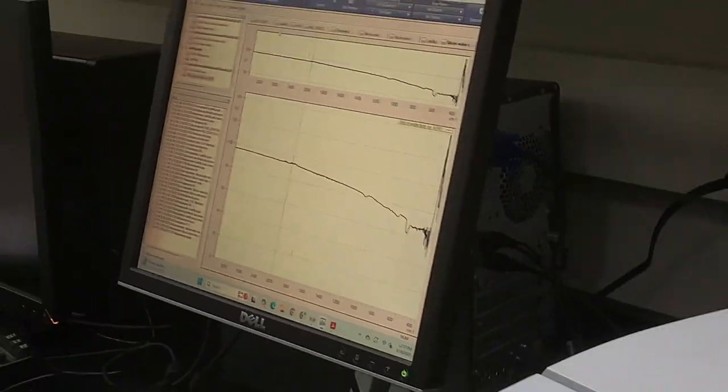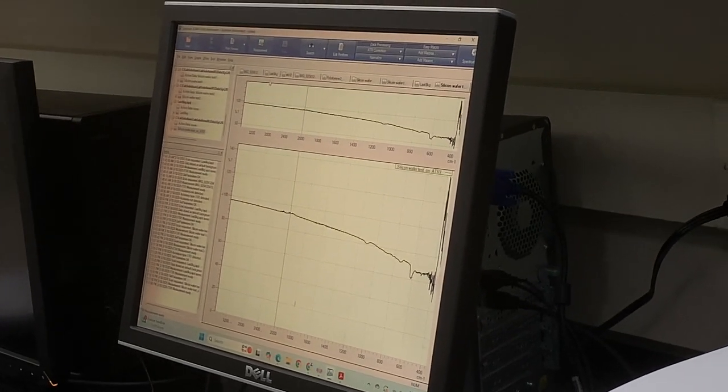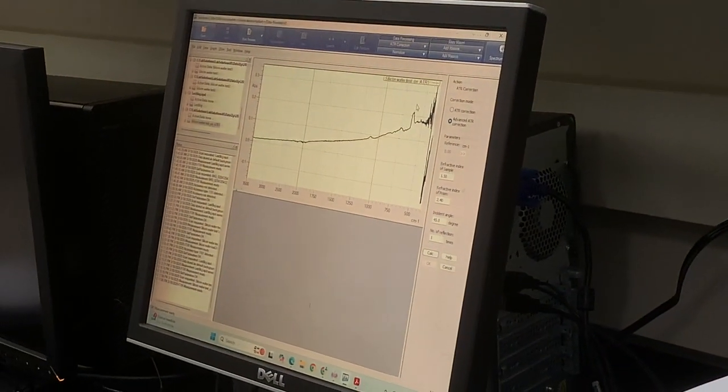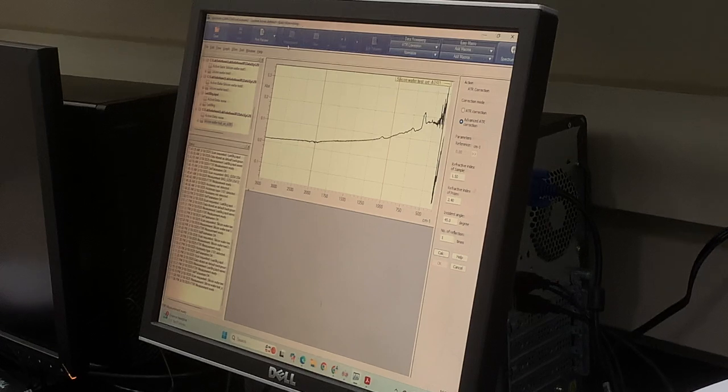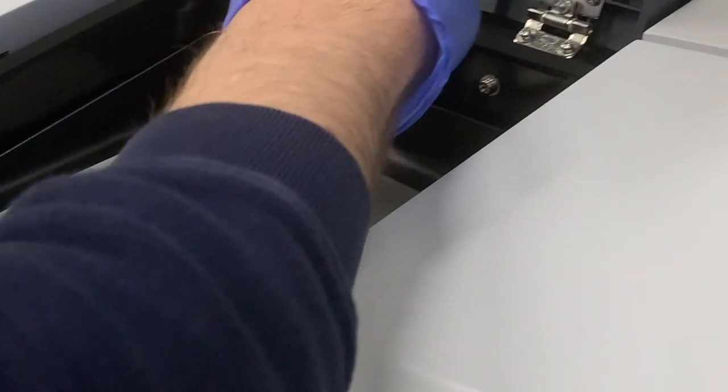And just to confirm, the wafer's down, right? Both sides are not all the same way. Oh, both sides. Okay, good. Yes, but the torque is not torqued all the way. No, it's not totally. Okay, that's why I was wondering why we're barely reading anything. Can we torque it all the way? I'm not afraid for the diamond crystal, it's going to be fine. More pressure? Keep going, because it should click. Yep, there it is.